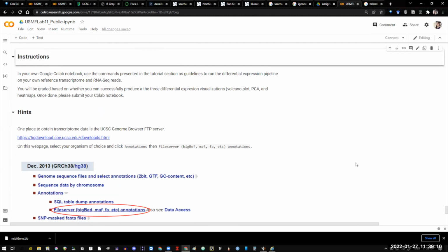Actually, yeah. So basically, I want to say that if you want to know all the arguments for each of these libraries, then you can go to the documentation. For example, if you type salmon on Google Chrome, it will go to the documentation and show all the arguments that it has. And if you want to know how the tool works, you can also go through their source code. All of these are open source software.